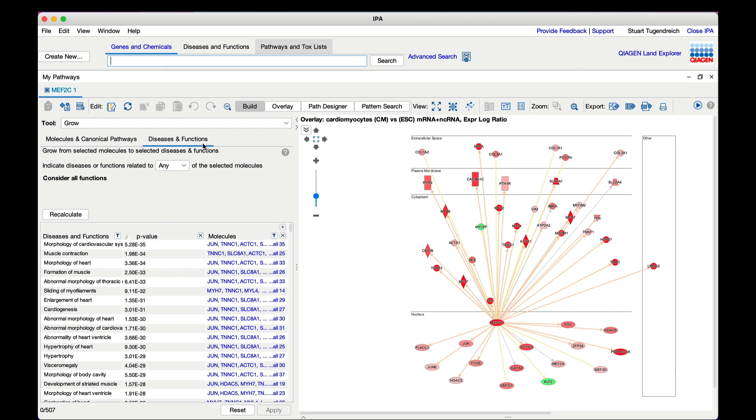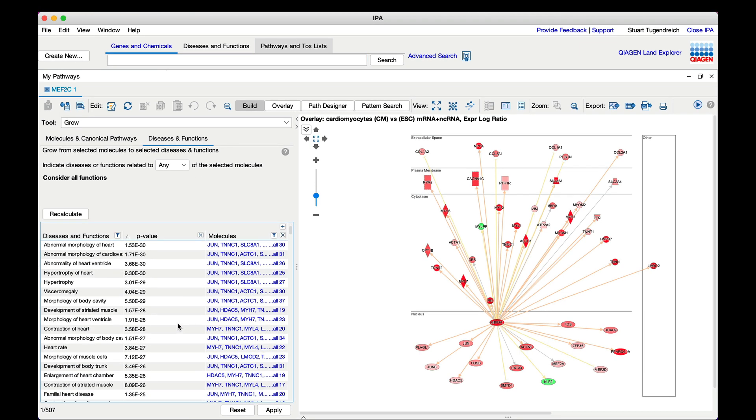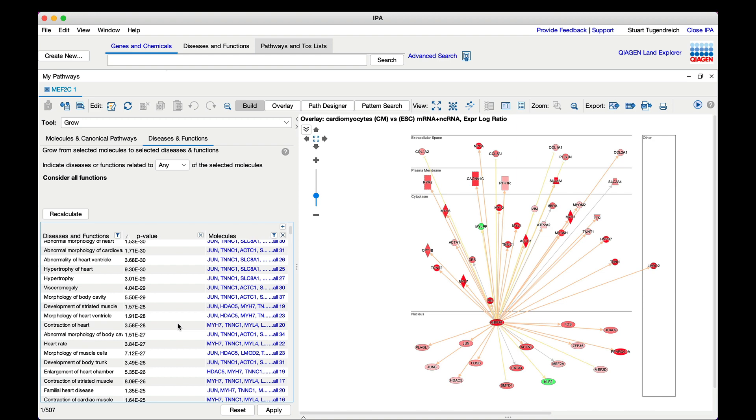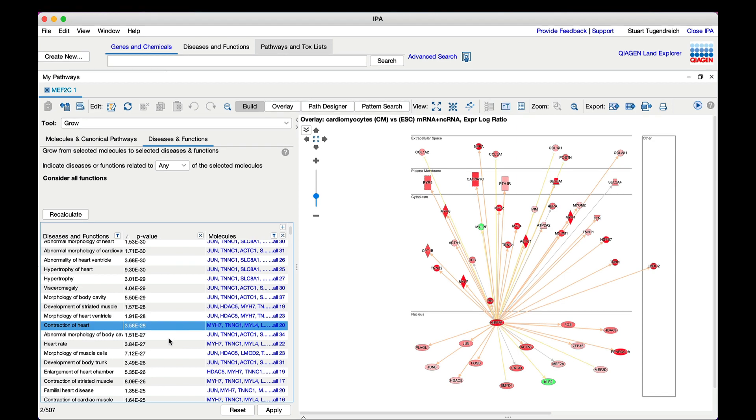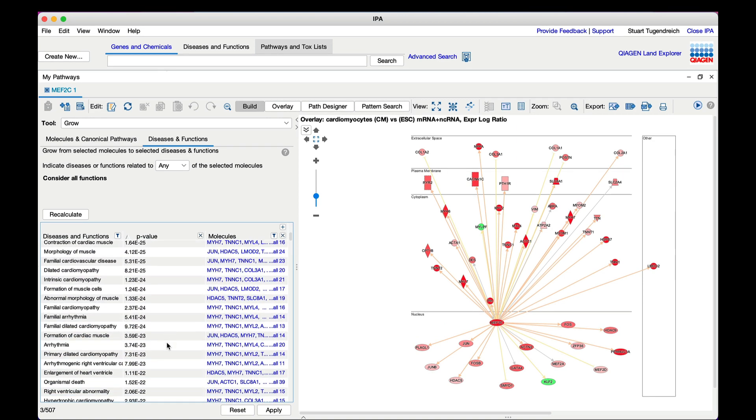Select functions such as arrhythmia, cardiogenesis, contraction of heart, and heart rate, and add them to the network. Hold the Command key down on Mac or Control key on Windows to select multiple terms, then add them to the network.